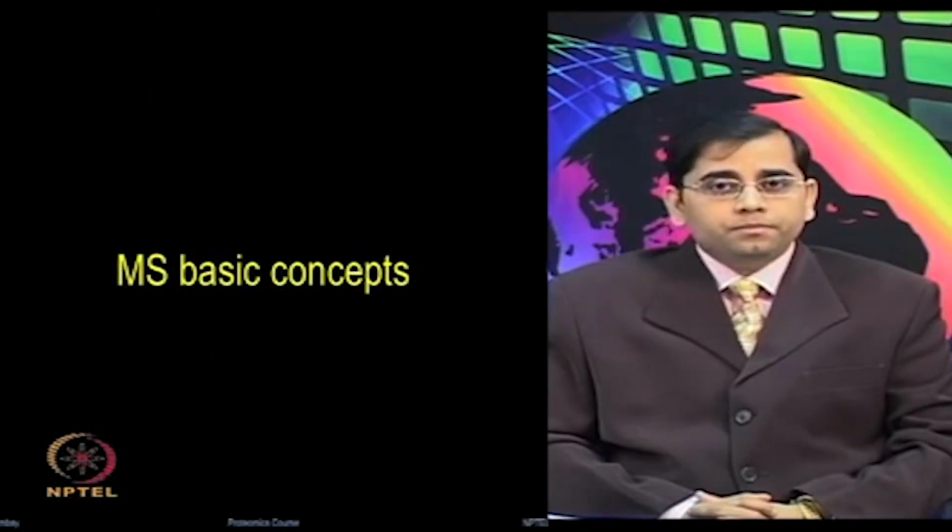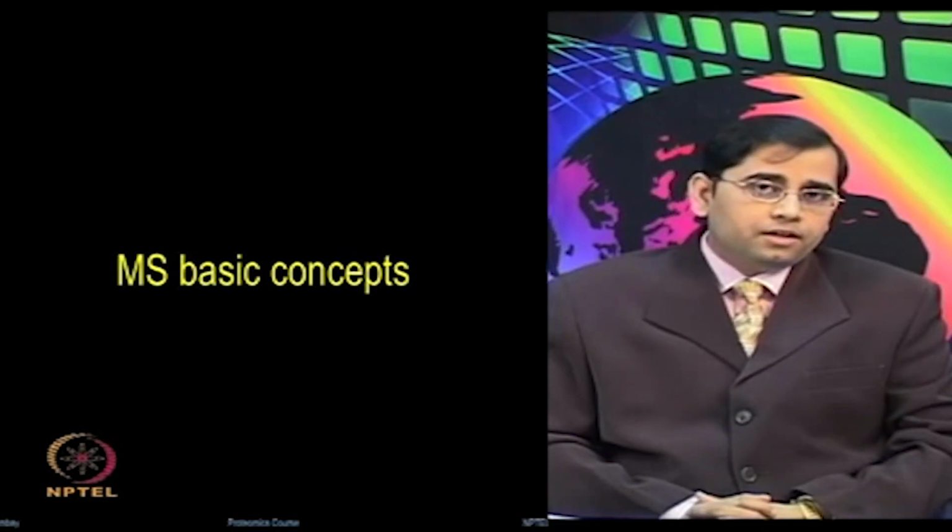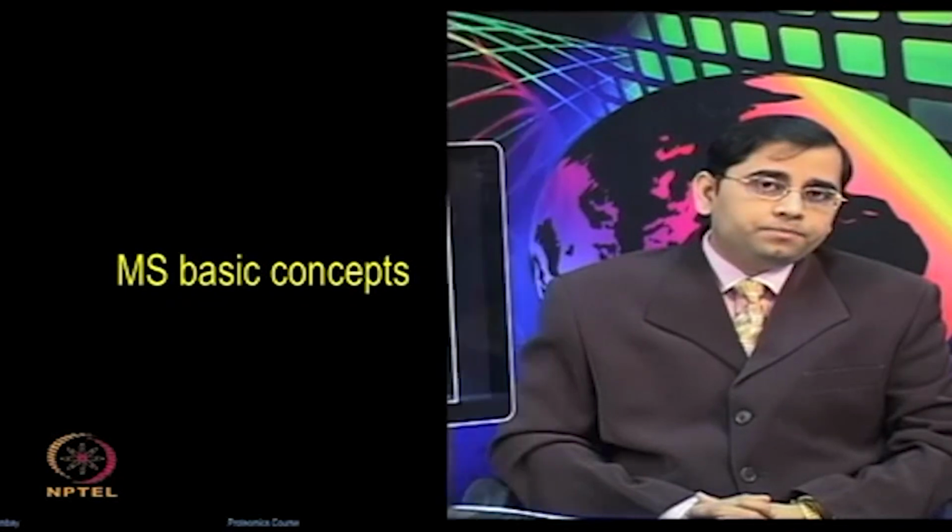MS has become an important analytical tool in biology in general and proteomics during the last decade, and now various applications have emerged by using the MS based platform. It offers high throughput, sensitive and specific analysis for many applications. Let us first look at some of the basic concepts of mass spectrometry.